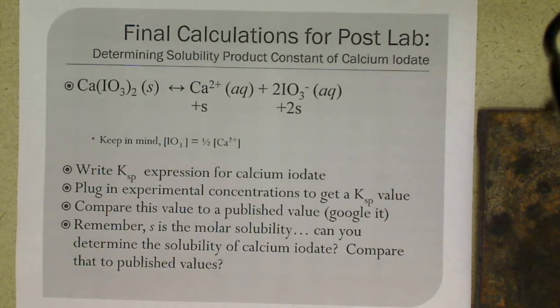So that's it. It was a lot to get through. Hopefully this will give you a little bit more purpose of what you're doing in lab, and hopefully this will help you organize your lab notebook, the tables of what you need if you like tables, and figure out just what information you need to collect so that you can be as efficient as possible while completing this lab. Another thing to keep in mind is that the glassware is going to be very tight, meaning that you are going to use pretty much every piece of glassware in your drawer.